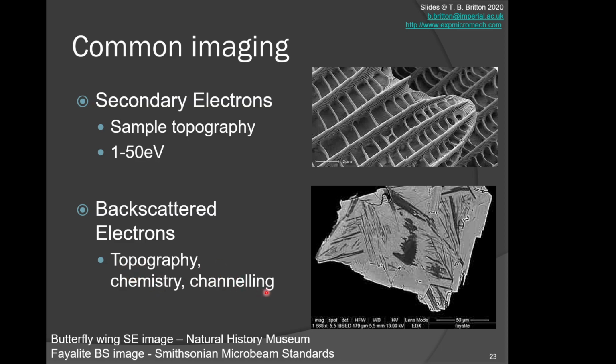And due to some subtle effects, because we're often imaging something like a crystalline sample, you can also get electron channeling, and we'll see what that is in a bit. This is related to electron diffraction, but very briefly, that can give you access to information inside our materials, and that can be very useful, and it's important to consider in a variety of challenges for materials characterization.